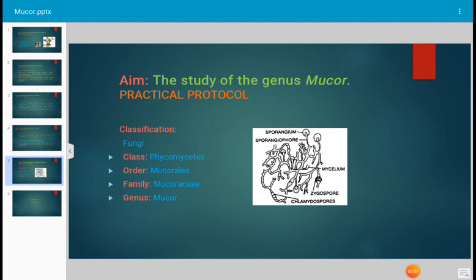This is all about the practical of Mucor. We simply remove the mycelium, prepare a slide in a drop of cotton blue, and observe under the microscope. This is the practical for B.Sc. first year, and everything must be done in sterile conditions to avoid environmental contamination.